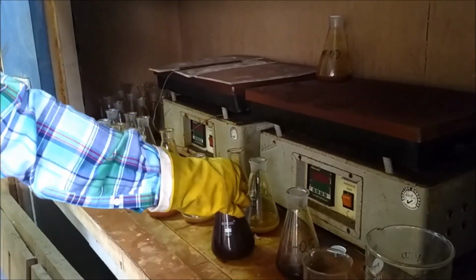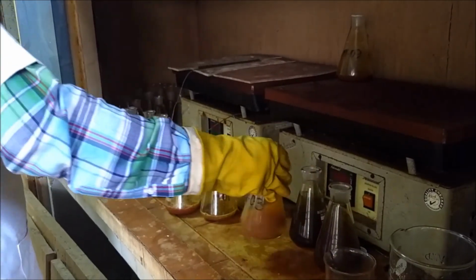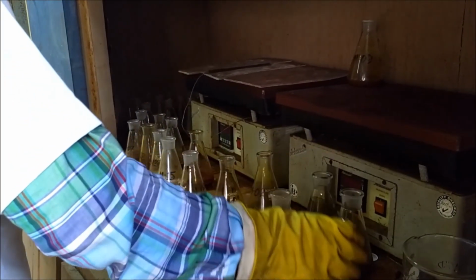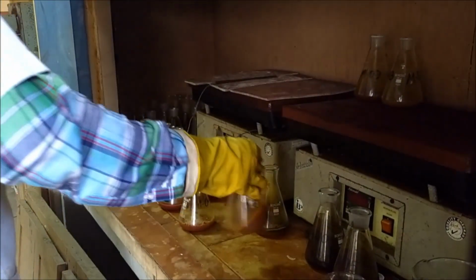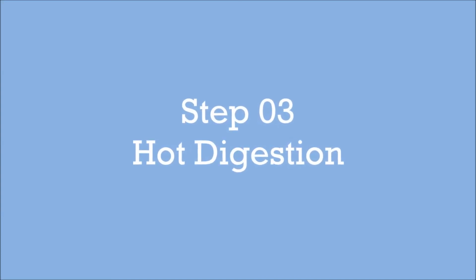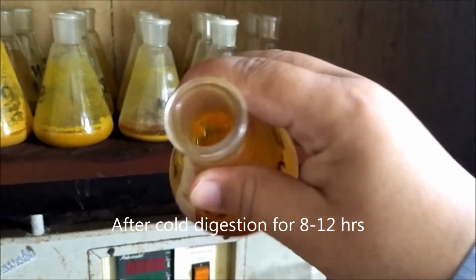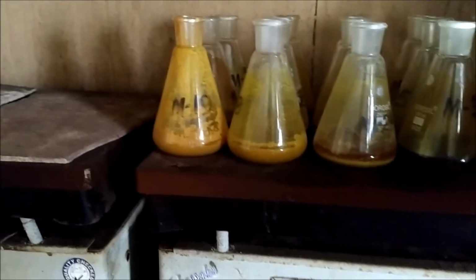Now slowly we will put all these things on the hot plate. The bottom of the flask should not be stuck with the sample or acid. It should be a homogeneous kind of solution. Step 3. Hot digestion. In this step, we will heat the cold digested samples at 150 degrees Celsius for 2 hours or till syrupy mass is obtained.